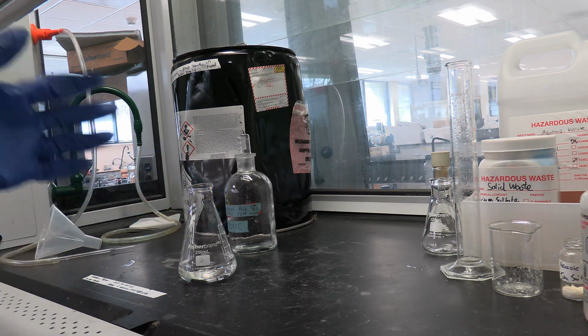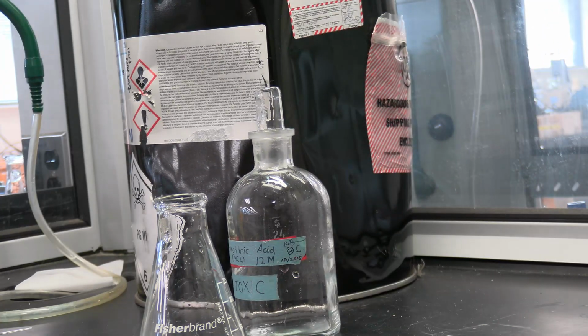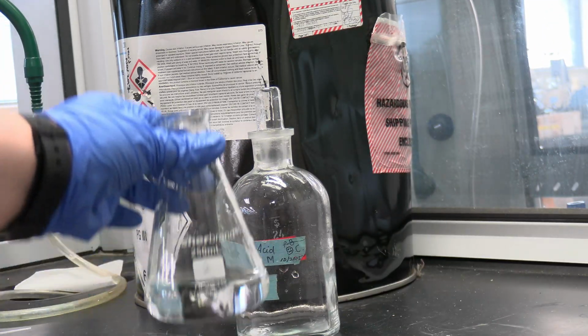Now that I can add that to the water, all I have to do is swirl the flask a little bit to mix, and it should be ready to use. That's all for making certain concentrations of acids and bases.